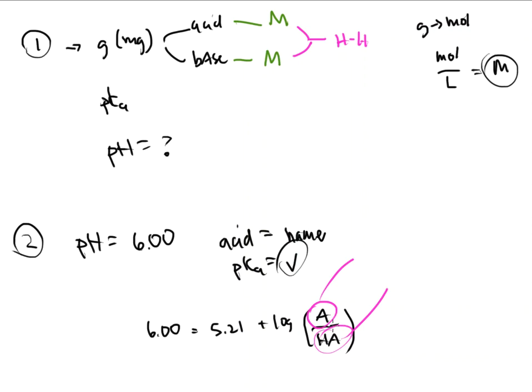They will have to give you a total that you're after, so one of these will kind of be X, and one of these will be your total minus X. That's traditionally how these problems are handled. So you will have two variables, one on the top, one on the bottom. You'll have to use a little bit of algebra in order to solve that problem.